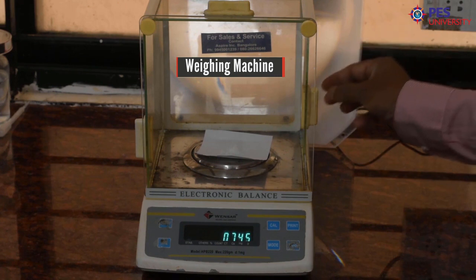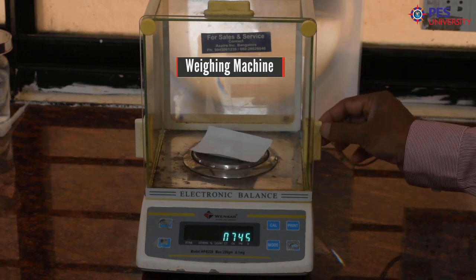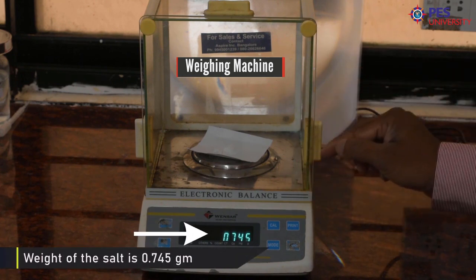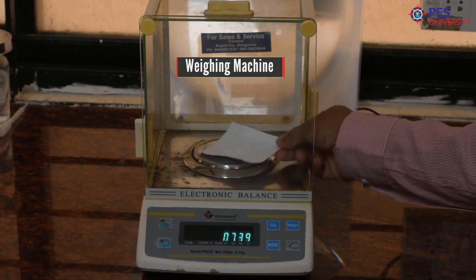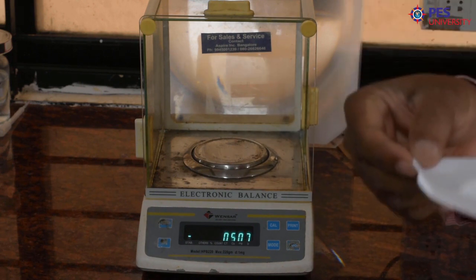After transferring the salt, close both the doors. Now the weight of the salt is 0.745 grams. Then take out the salt like this. Then transfer onto a funnel.